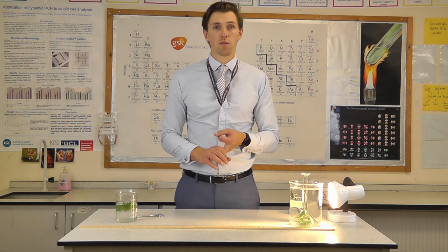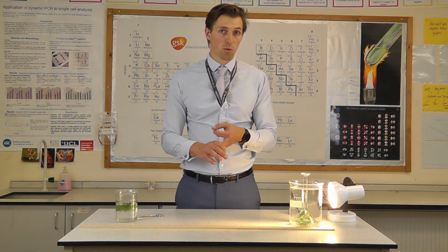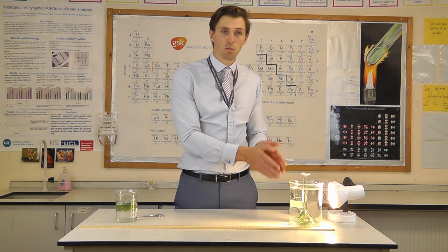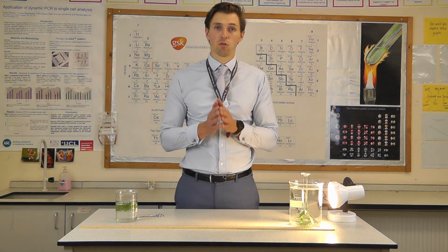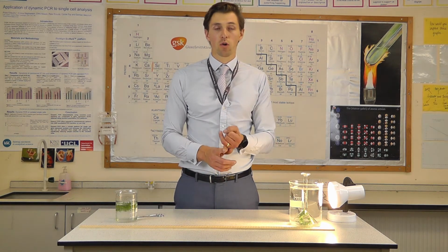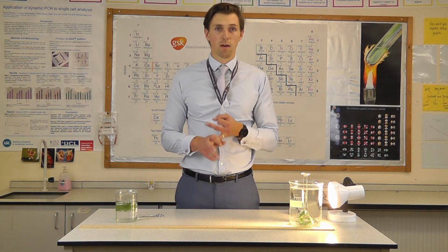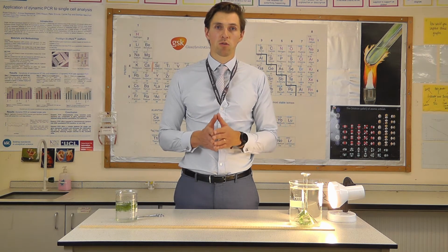The concentration of the sodium hydrogen carbonate solution is going to stay constant, it's a control variable. Also, you're going to make sure you use the same piece of pondweed each time, so that pondweed will stay in there the whole duration of the practical. These must be noted as control variables. Our dependent variable is either the number of oxygen bubbles produced in a time period, or the volume of oxygen produced in a time period. Let's move on to plotting our graph, and I'll talk about how we can look at these results.